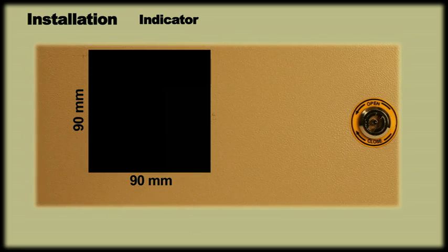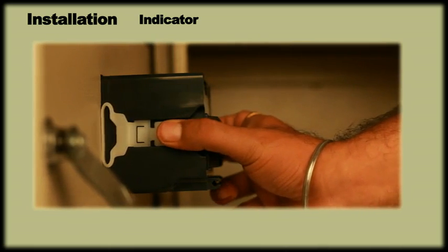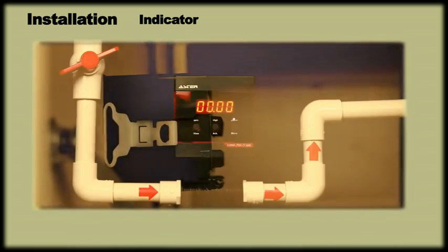For panel mounting, make a 90mm by 90mm cutout on your panel plate. Slide the meter through the cutout and fit it with side clips to lock it. That was all about the installation process. Now we shall see the wiring connection.